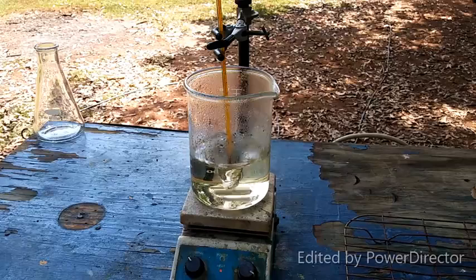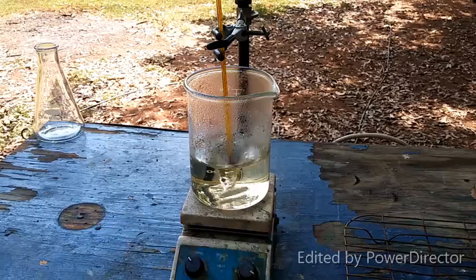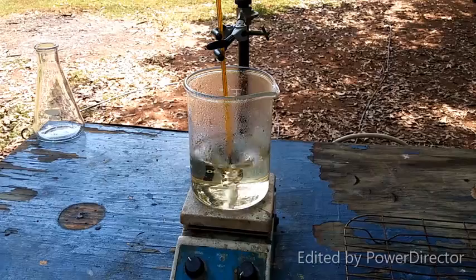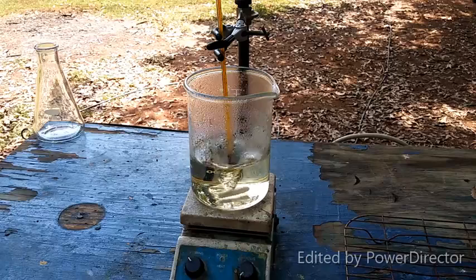ChemPlayer recommends chilling it before the next step, and since by following their tips I'm already getting much better results than I did the first time I did this, we're going to go with that. So I'm going to put this on a little bit of ice after I take it off here and let it cool back down to around 10 degrees C before we move on to the next step.